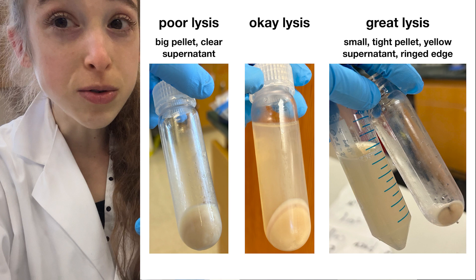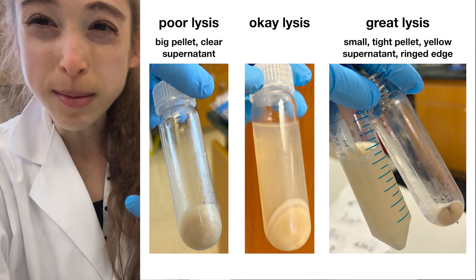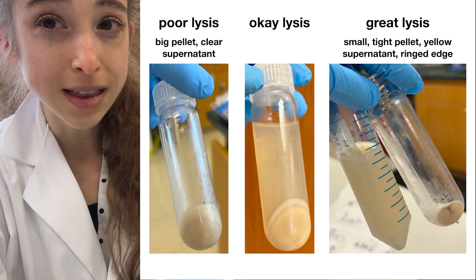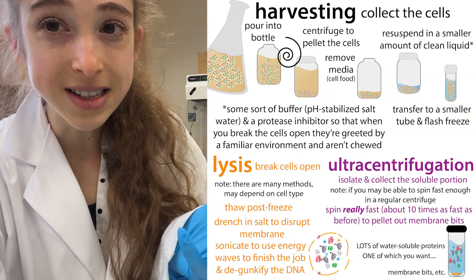If the lysis didn't work well, you'll get a bigger, softer pellet. You won't see those rings, and the liquid is going to be pretty clear — it's more like you just gave the cells a bath.